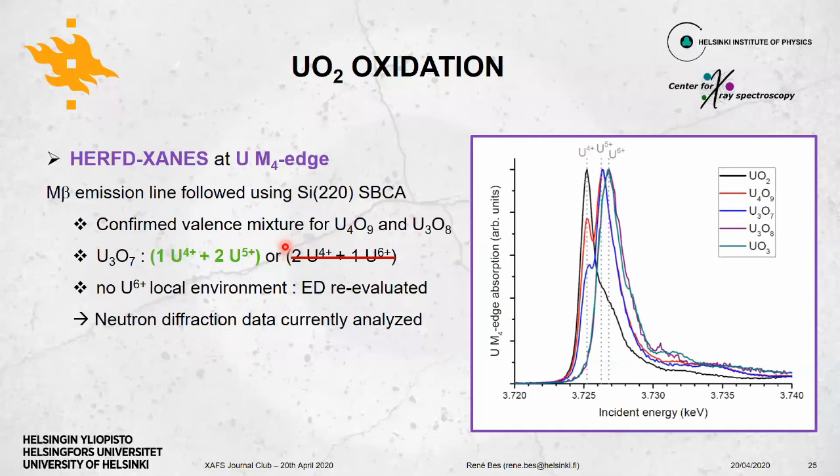M5 can also be used without any big problem, I think. I think we measured sometimes M5. I don't remember exactly. I probably have some spectrum at M5, but if it's possible, use M4. For other actinides until plutonium, I guess you need to stay at M4 and go to M5 when you start with americium and higher, but mainly because of the scattering angle on the crystal analyzer.